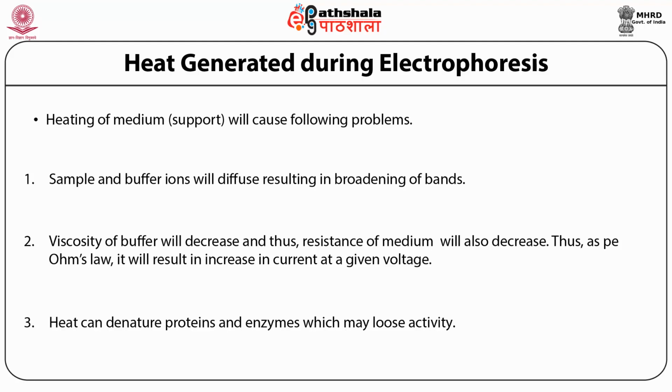Also, it will denature the proteins and enzymes, which will lose enzyme activity or protein activity on separation. On many occasions, we are interested in knowing or measuring the enzyme activity or protein activity after separation of molecules. If heat is not taken care of, then it will result in inactivation of these activities, and we will never be able to observe the activity of these separated molecules after electrophoresis.